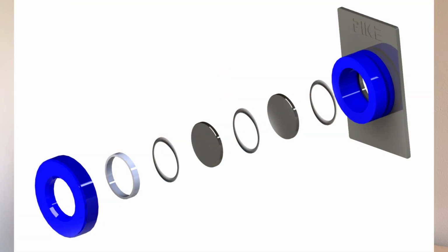But what I wanted to cover today is the liquid demountable cell. Now that cell, you can take it apart, change the spacers, reassemble it. You can take it apart to clean the windows, unlike a fixed path length cell like the Smart Seal cell. I wanted to see how much I changed the path length by assembling the cell a couple of times. So let's take a look at the transmission spectra of these empty cells.